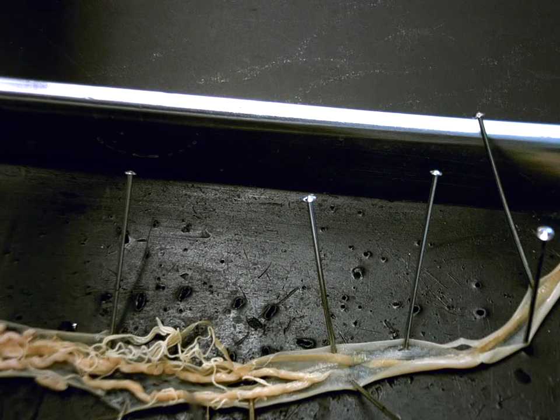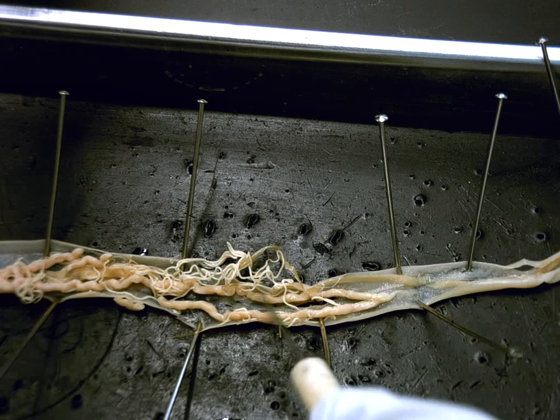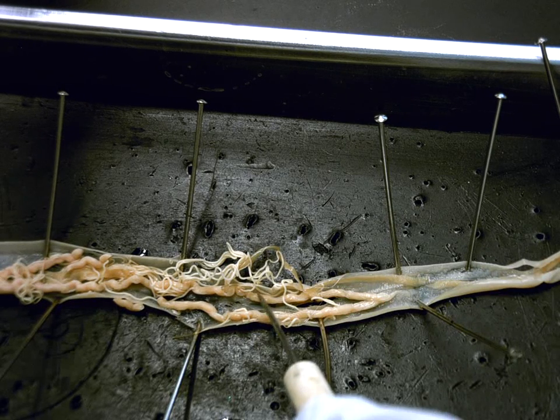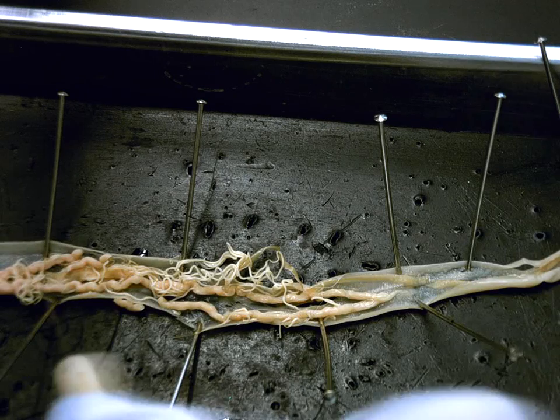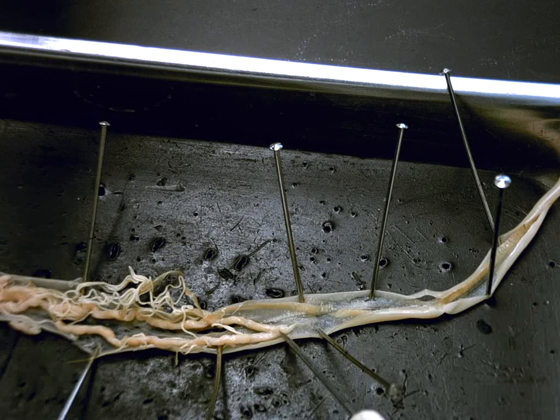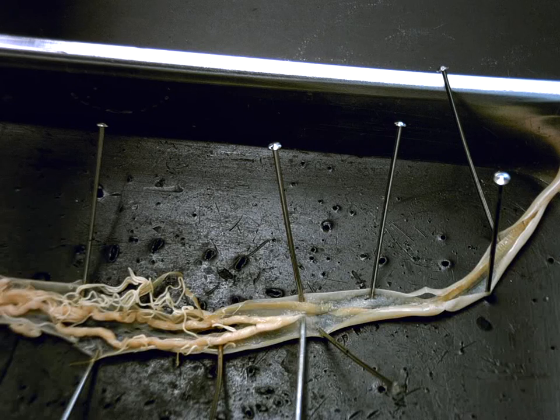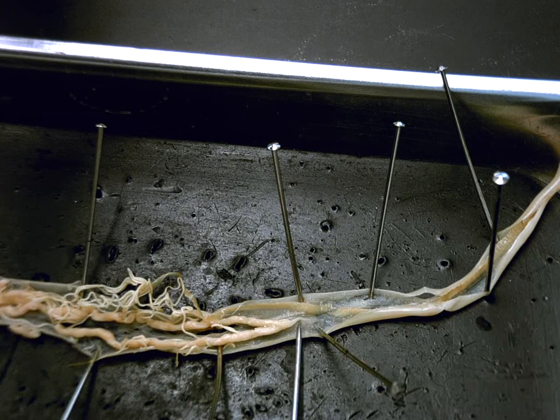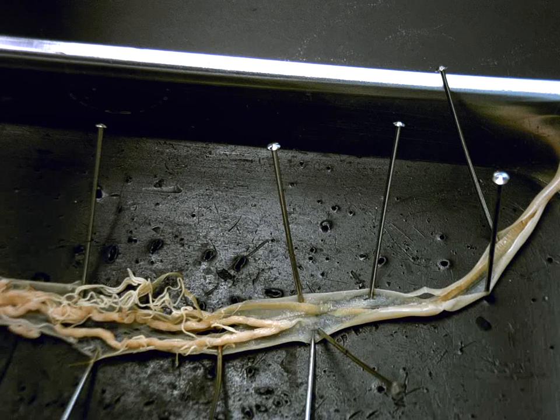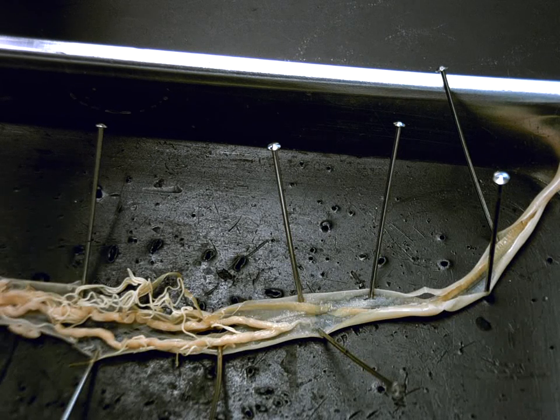While there's still two tubes running down the worm, which is what we see all over here, these two pink tubes are called the uteri, which would be, again, one uterus and two uteri. So they have two of them, and when they unite right here, towards the anterior part of the worm, we call that the vagina. And on this one, luckily, when they cut it, you could see the tube. If I pick up her reproductive system, you can see the tube here, a really tiny, skinny tube that goes down and then attaches into the wall of the worm, which would actually be her female genital pore, or her vulva.